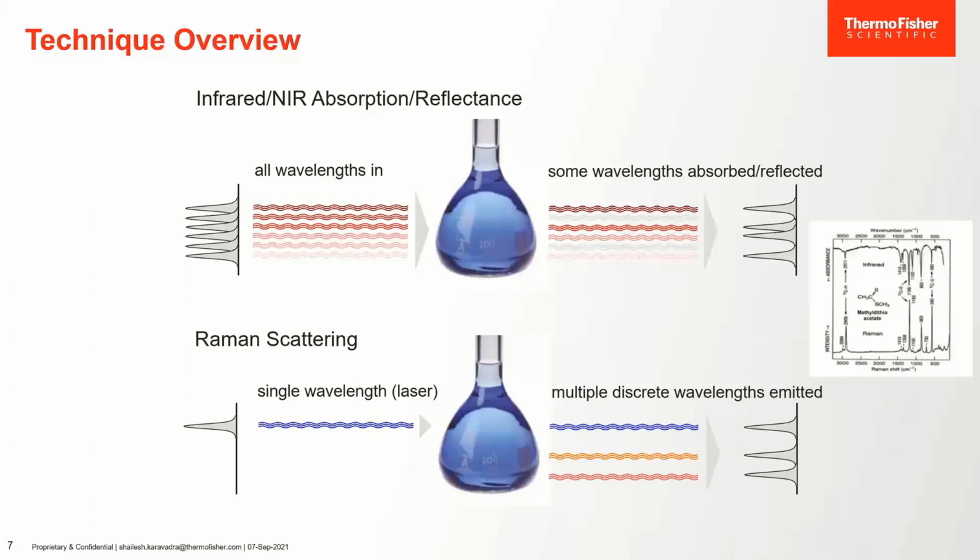Most of the time, Raman scattering where energy is gained is designated as Stokes. The Raman scattering where energy is lost is designated as anti-Stokes. Most of the time, as anti-Stokes Raman light is less intense than the Stokes, anti-Stokes is not used. However, it does represent equivalent vibrational information of the molecule.